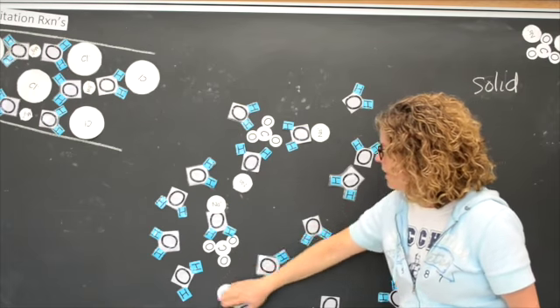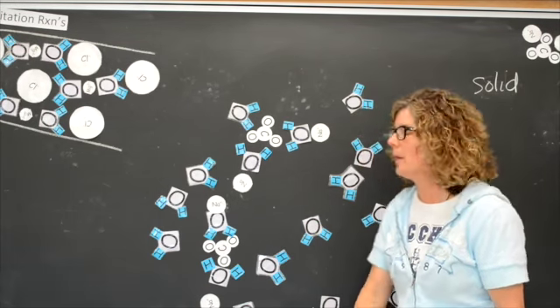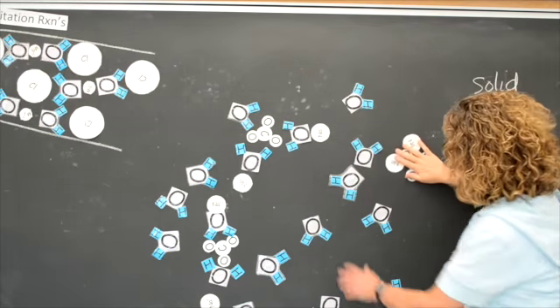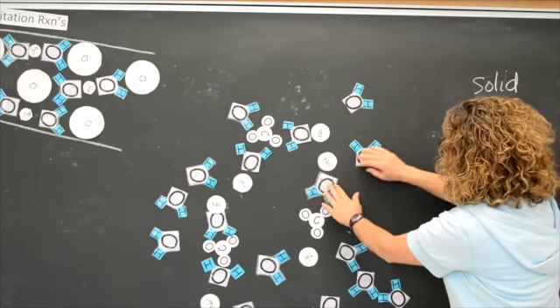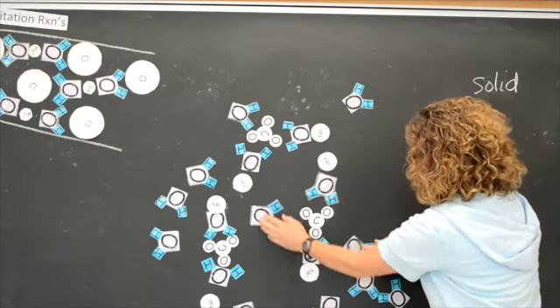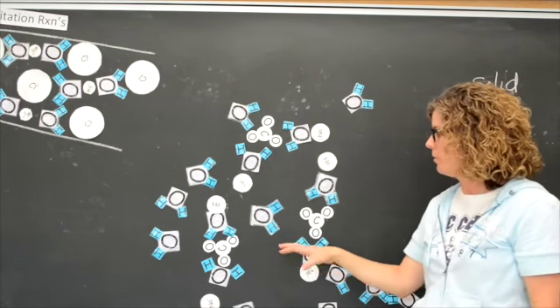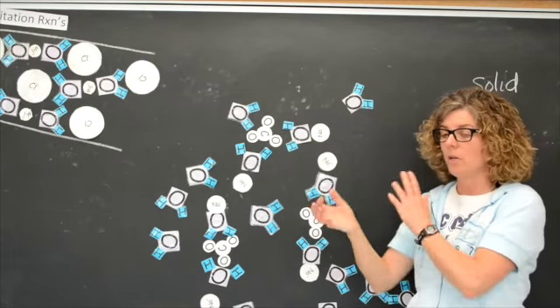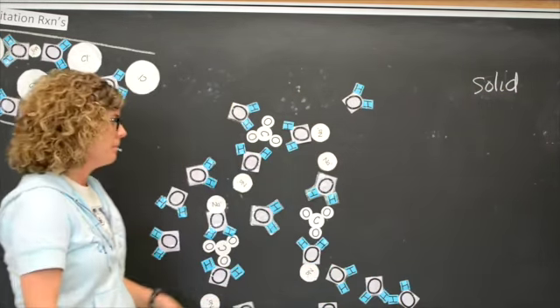Water getting in between, and we have dissolved our sodium carbonate. I'll do another one. Okay. Get in between and dissolve that sodium carbonate. Okay, so now we have a solution of sodium carbonate. I'm not going to show you this because we're actually going to do it in your experiment on Monday.